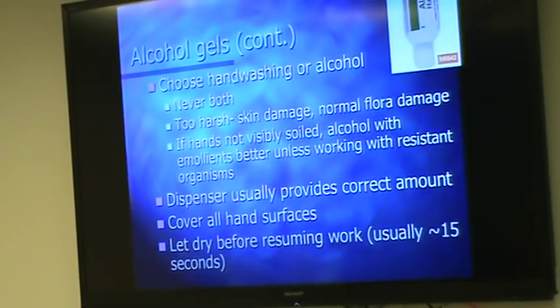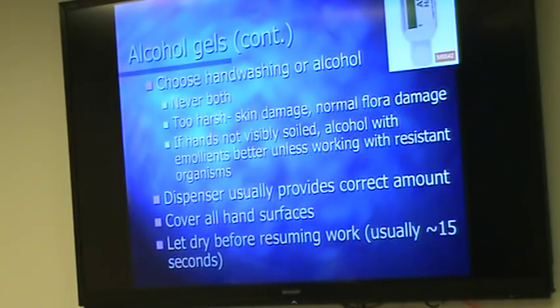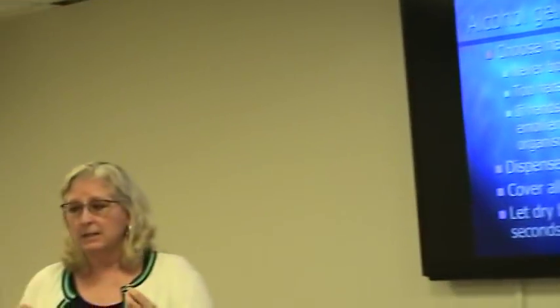Part of that is that it's just too harsh on your skin, and you guys probably are intuitive about this anyway. If you're alcohol decontaminating, you don't need to wash, and if you're washing, you don't need to alcohol decontaminate. One of the things that's very protective on your skin is your own normal flora. So there are skin organisms that belong there, they're yours, and so there's a competitive disadvantage to new pathogens if you have healthy flora on your skin. So maintaining your own healthy flora is a good thing because it makes it more difficult for a pathogen to take hold.